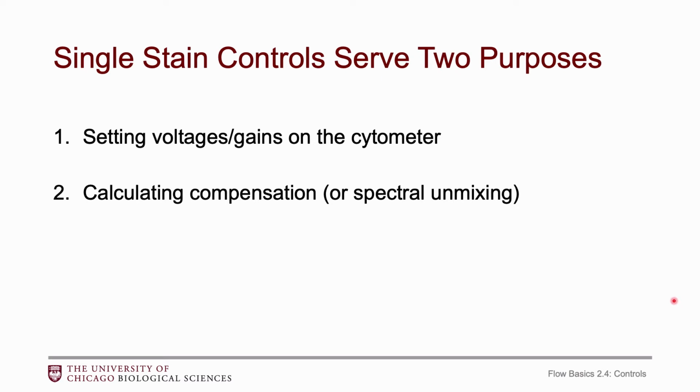So as I mentioned, the single stain controls have 2 purposes. The first one is to set the voltages or the gains on the cytometer. The second one is to calculate the compensation, or if you're doing spectral, calculate the spectral unmixing.